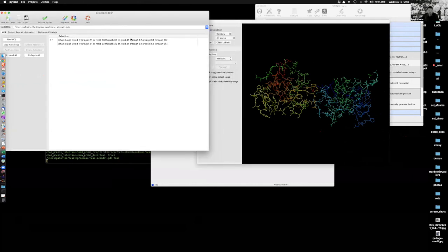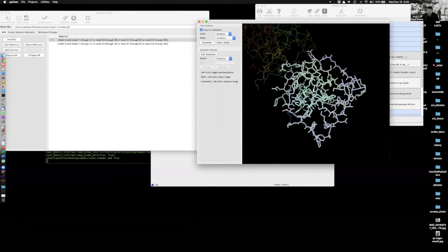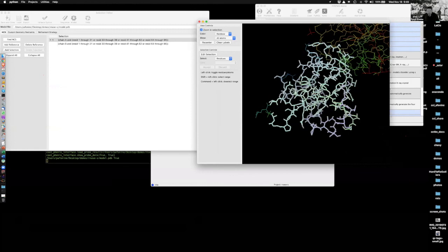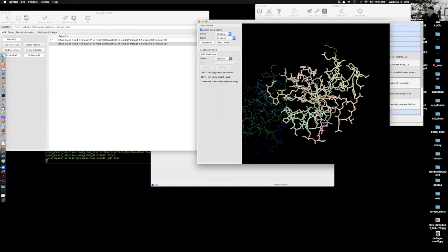So we click on the first one, and it selects everything, but for some reason it excludes this one residue, there's another residue, and there's another residue. You click on the related copy, and it also excludes those residues. So just physically, it would be more meaningful to actually include these residues, and there's no point to think those residues are going to be very different in this context.